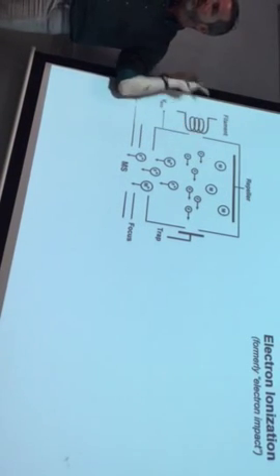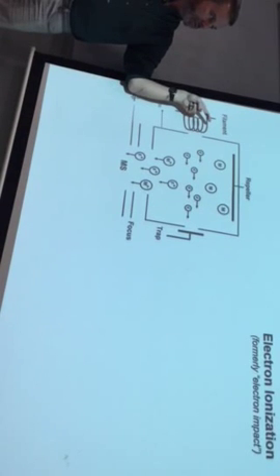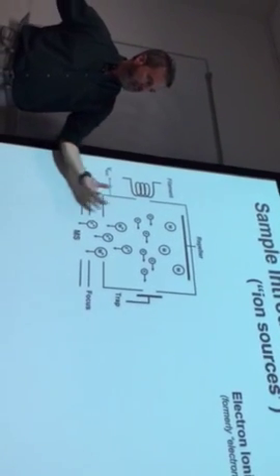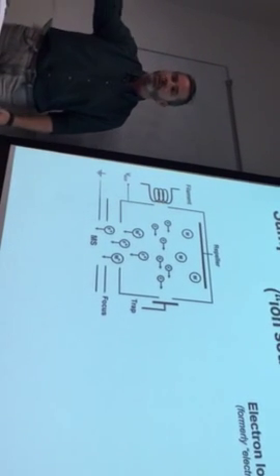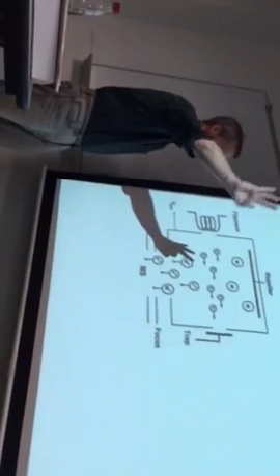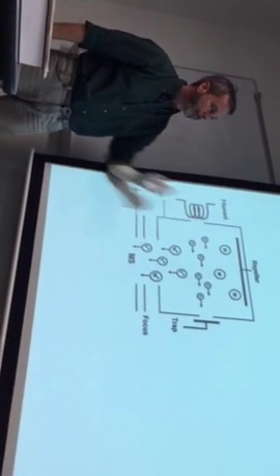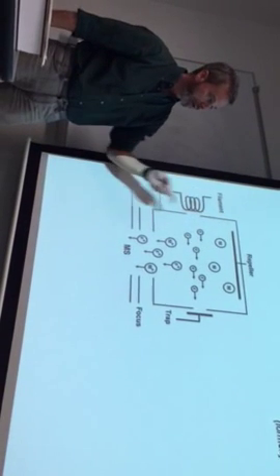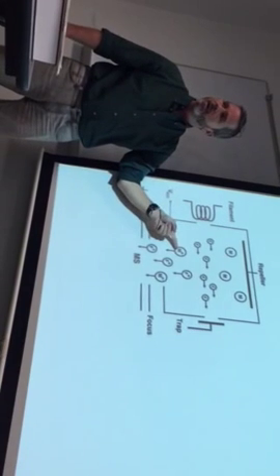Everybody good? We're generating, what's the word, a stream of electrons, relatively high energy. They are being emitted by this filament, attracted to this trap electrode over on the right-hand side. Our gas phase molecules are introduced somehow to this region, let's just say through some sort of an inlet that's normal to the plane of the screen here. In come the gas phase analyte species, labeled M here. And by this electron ionization process, they interact with that high energy electron stream, in the process becoming ionized.